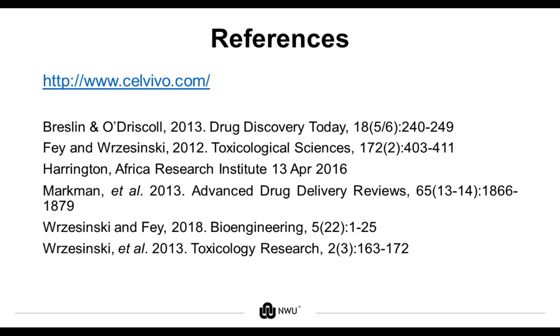So it looks like we have about 5 more minutes to answer any questions. Let's go to our next one. Can we detect metabolic reprogramming of tumor cells in spheroids? Yes, you can. You can do it by using proteomics, where you take out your spheroid and sample it.